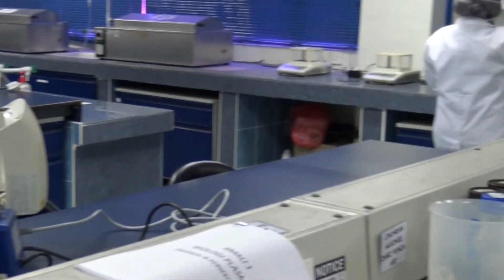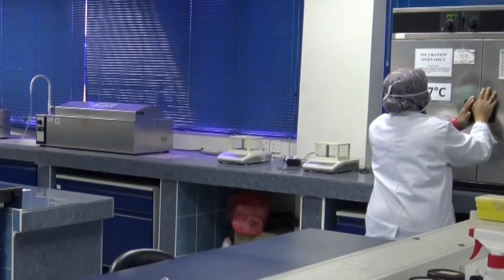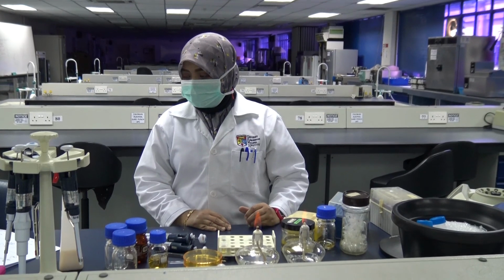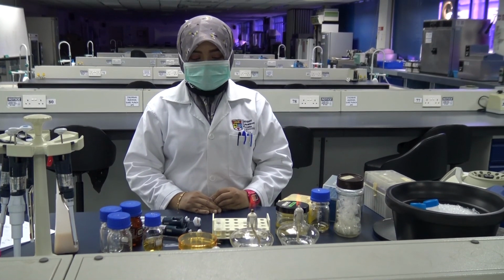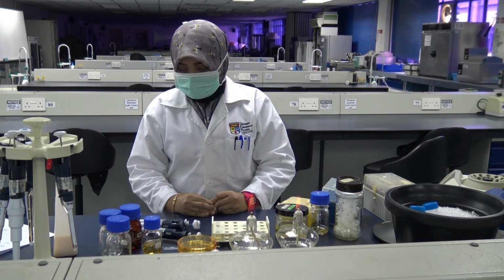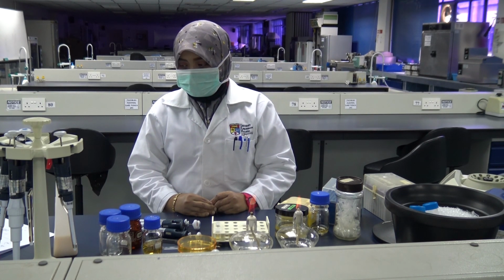Next, Fonzyma is placing the plate here into 37 degrees Celsius and leaving it to incubate overnight. So the next day, Fonzyma will come in to observe the plates to count how many colonies have grown on the nutrient agar plate and how many colonies have grown on the nutrient agar ampicillin plates. From there, we can calculate the CFU per ml arising from spontaneous mutation, divide that by the CFU per ml in the original bacterial suspension, and thereby you will calculate your mutation frequency.